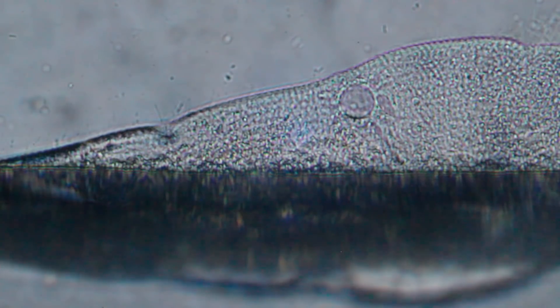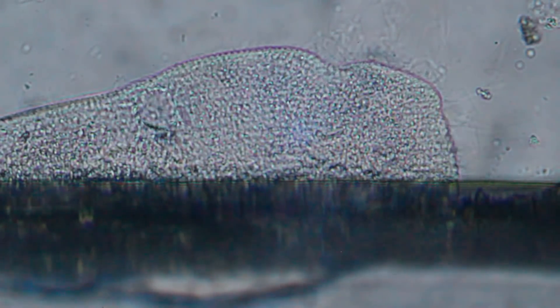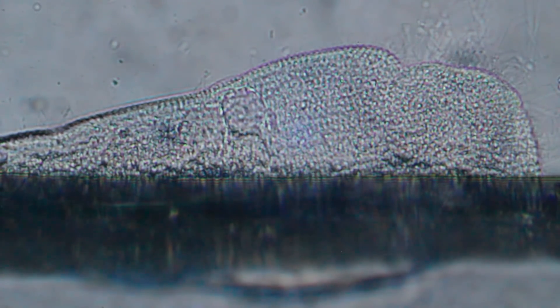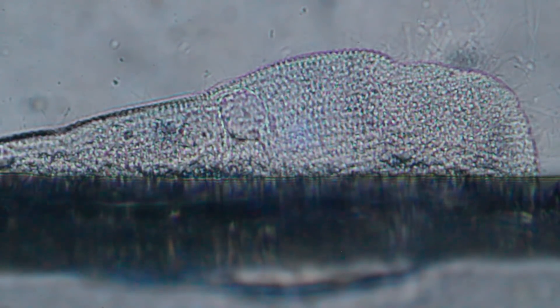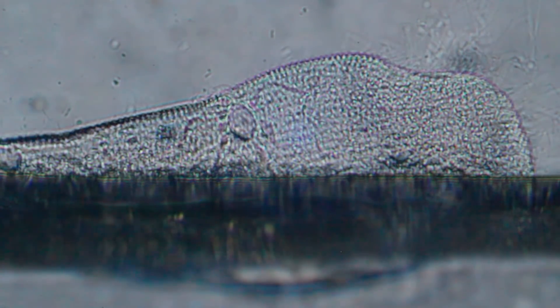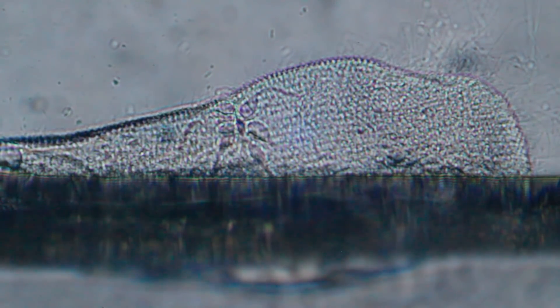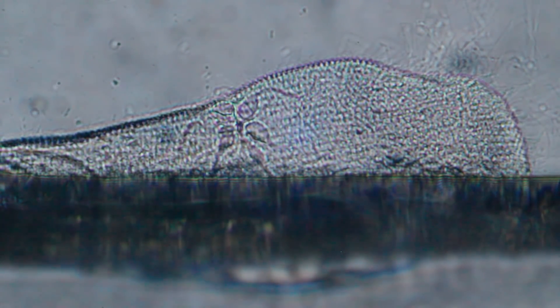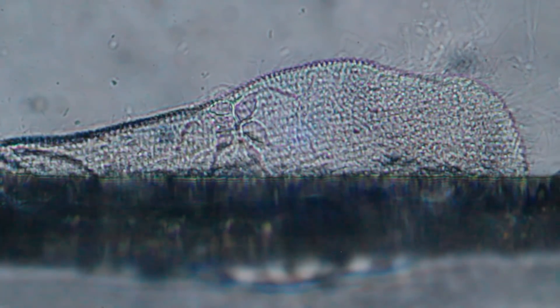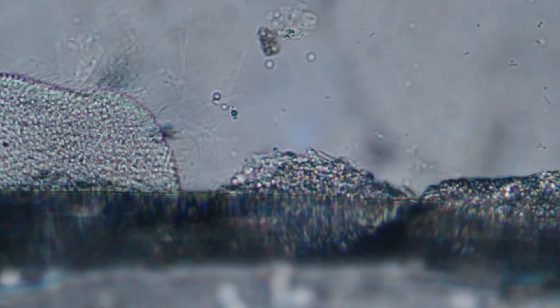That is the edge of the cover glass. And you can already see that the Paramecium is not looking so healthy anymore. The little cilia — the little hairs on the surface — you can still see them move, but it's not really healthy anymore. The surface is starting to shrink a little bit. The cilia haven't noticed any problem yet, so they continue to beat. If you look carefully, you can actually see that the cilia on the surface are arranged in rows — quite an ordered arrangement. So that is basically the death of the Paramecium, almost. But the cilia haven't even noticed yet that it's actually dead — they continue to beat.